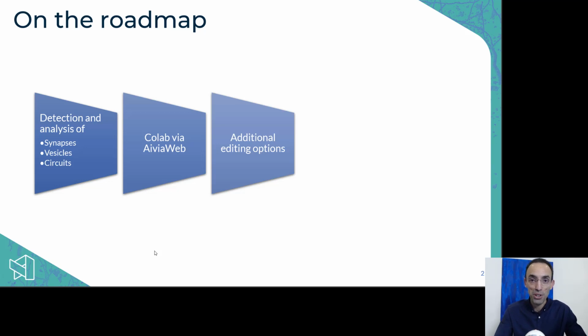And also thank you for your feedback. As you start using it, we welcome your feedback so that we can quickly add those additional tools or scenarios that you want to cover.